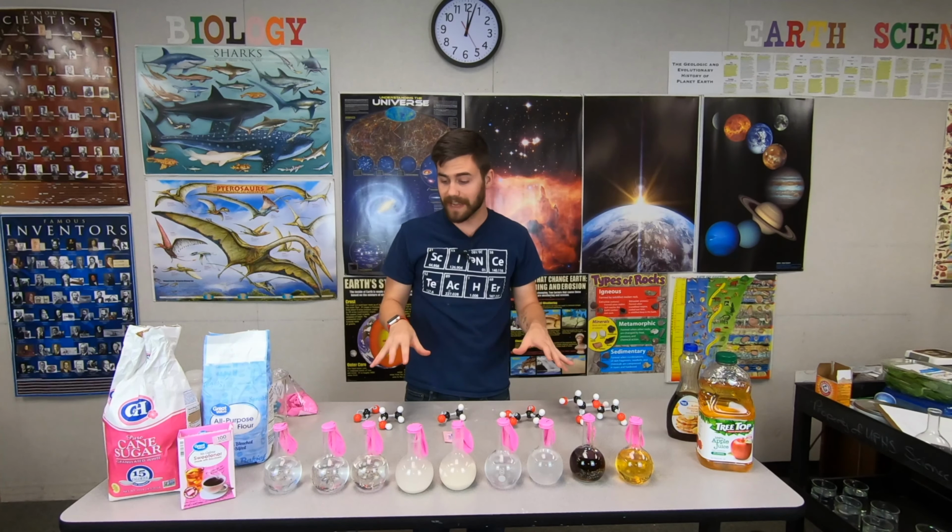Okay, these are ready to go. So we will add the yeast, and then we will let this run for approximately an hour, and we're going to compare how much gas has been made in each of these.